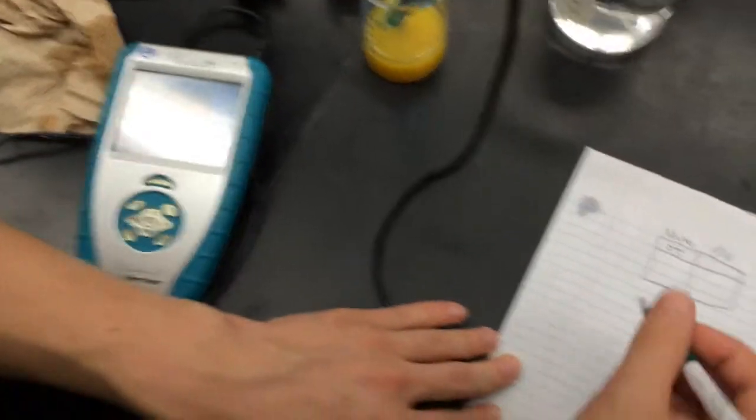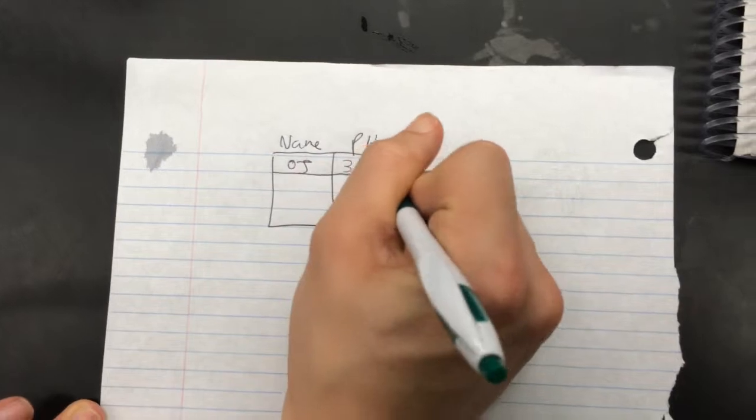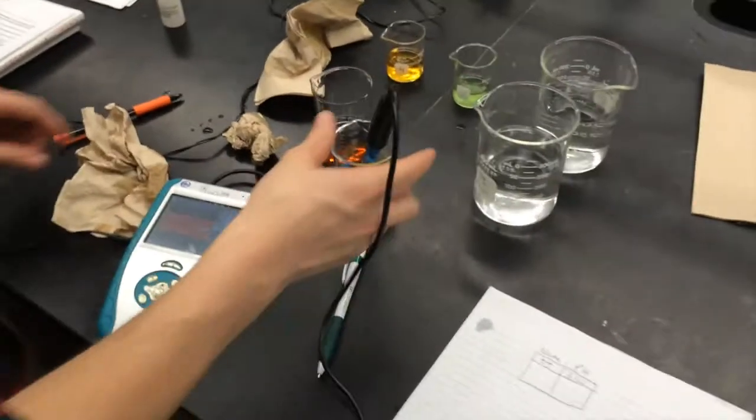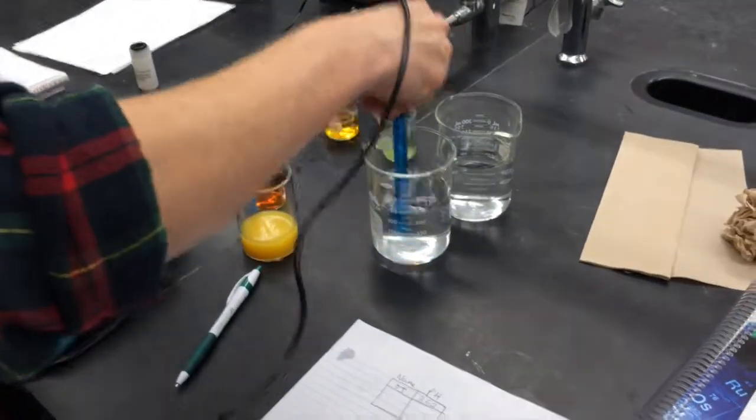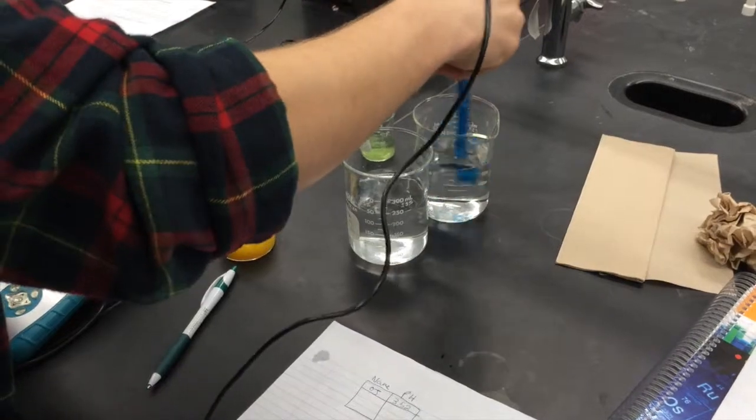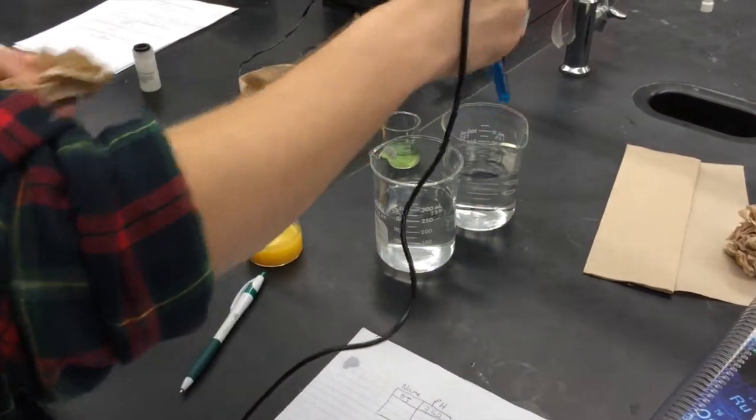Now Stephen can test this solution's pH. He had orange juice, which came out to a pH of 3.52. Stephen is now cleaning the probe for storage.